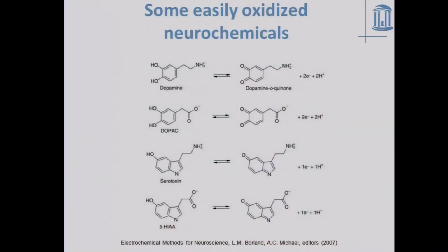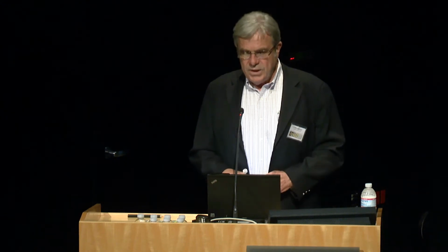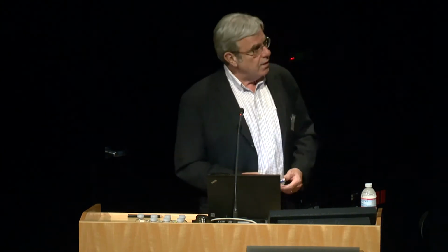You have to be careful in this game. For example, this molecule, dihydroxyphenyl acetic acid, or DOPAC, is the major metabolite of dopamine. So everywhere you've got dopamine, you're going to have DOPAC present. And this molecule's oxidation mechanism is quite similar. But it turns out that we can, in fact, get unique signals from dopamine compared to DOPAC and compared to other substances by using some techniques that I will show you here today. Serotonin, another molecule that's been mentioned here today, is also an electroactive neurotransmitter. It's a substance that we can use the techniques that I'll tell you about today to actually look at and monitor as things are going along.